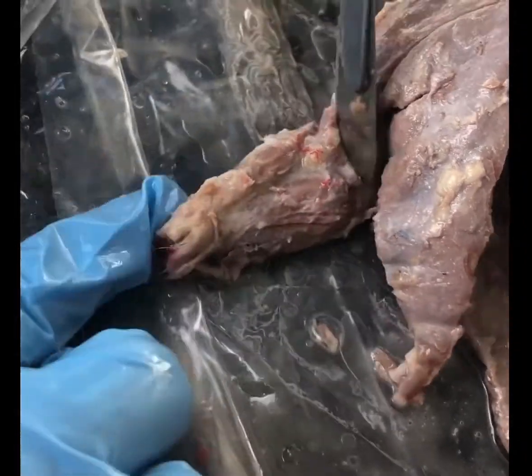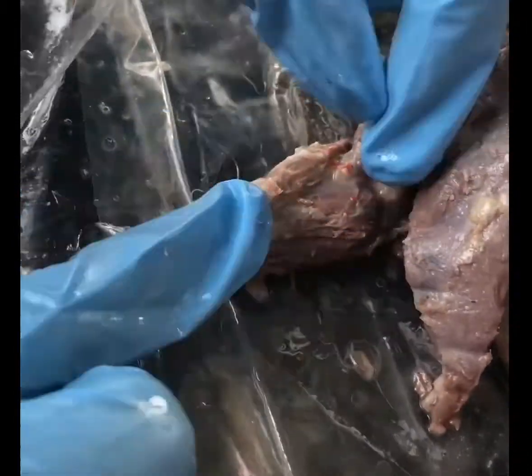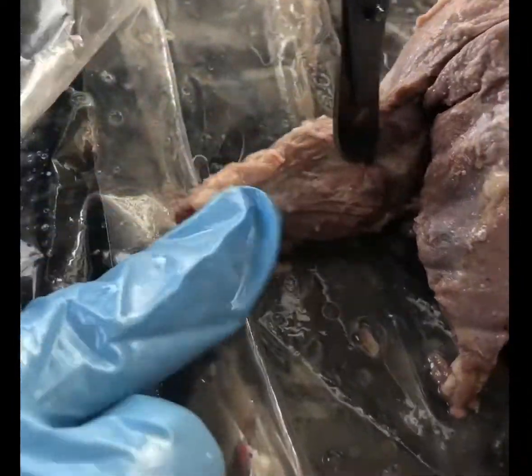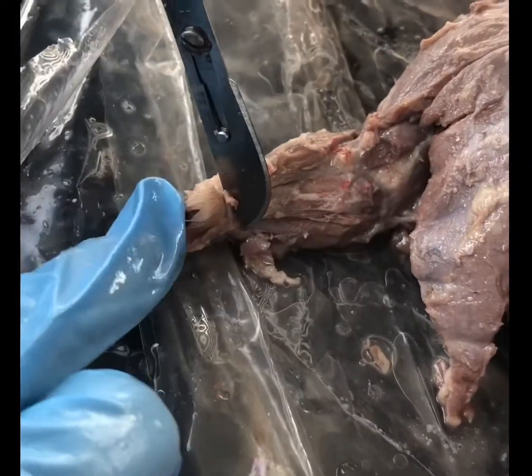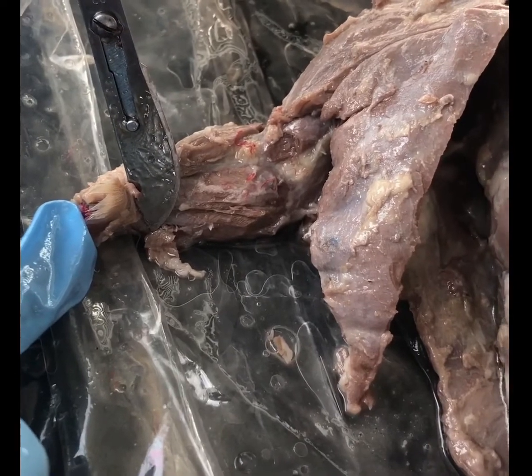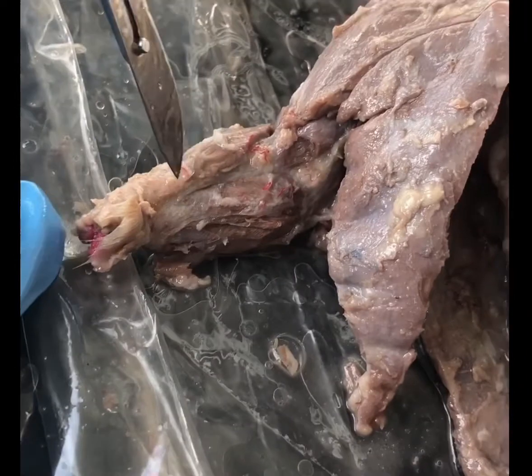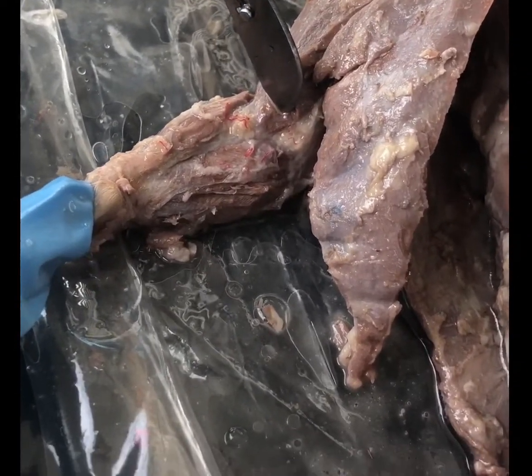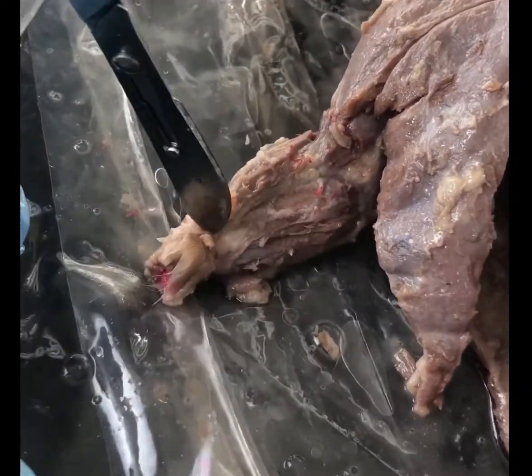So this is the joint, the elbow, right here. So it goes straight. It's the center muscle that goes straight down. So you kind of see it right here, from the elbow to the wrist. And then the extensor carpi ulnaris extends the wrist. It's on the left side, so it's from the elbow socket straight down, right on top of the ulna, down to the wrist.